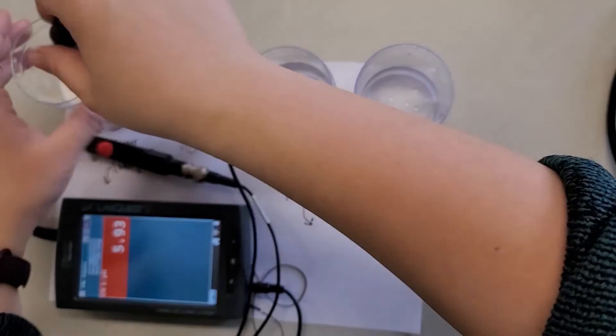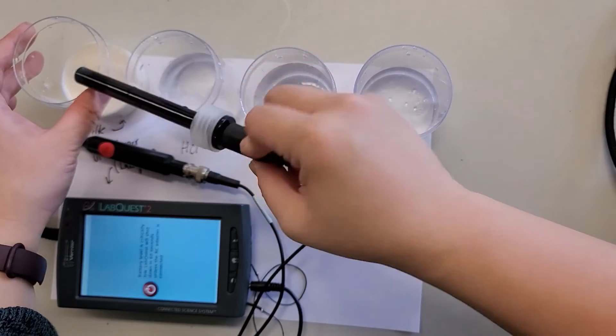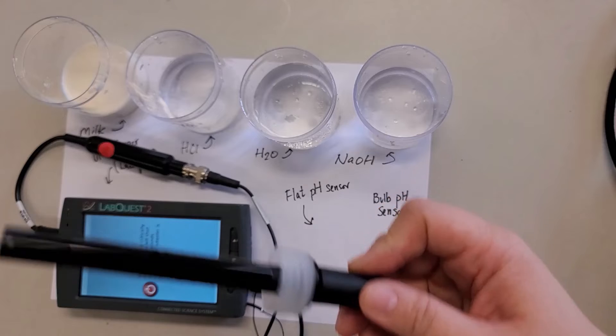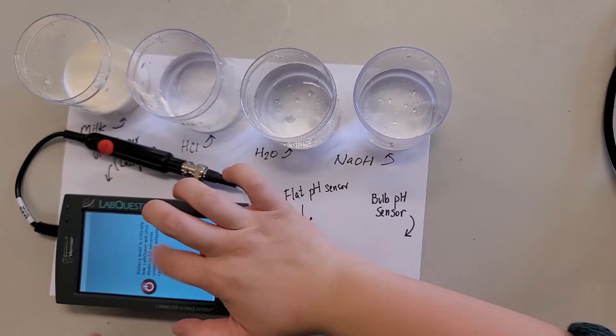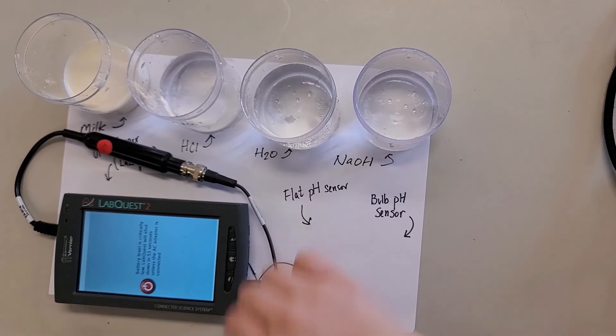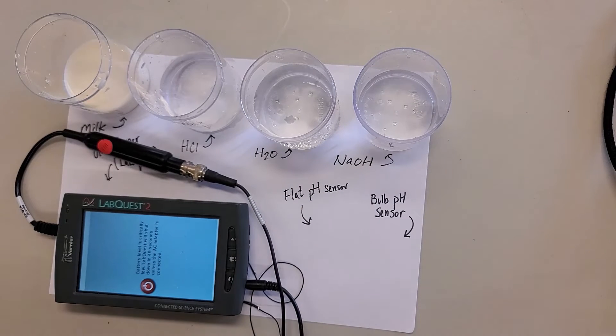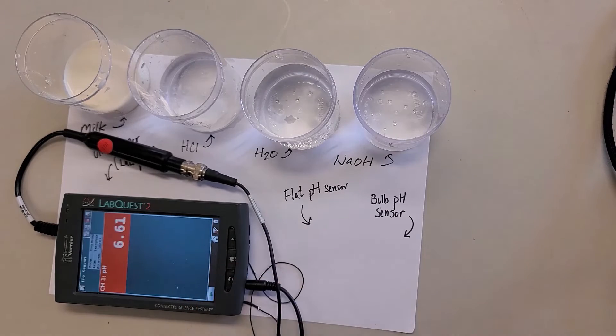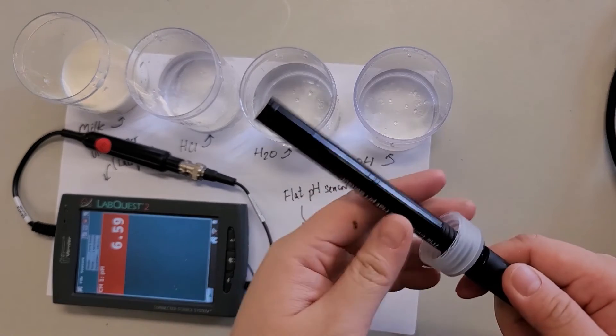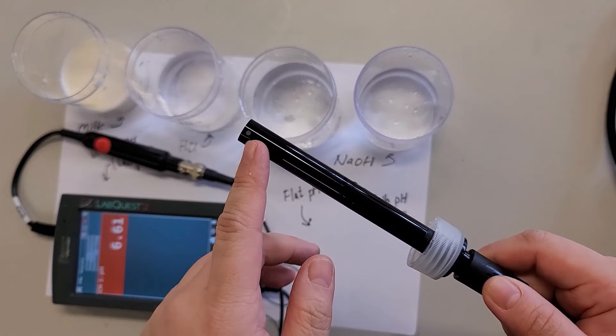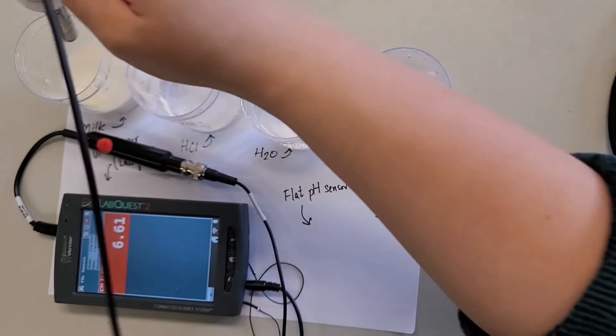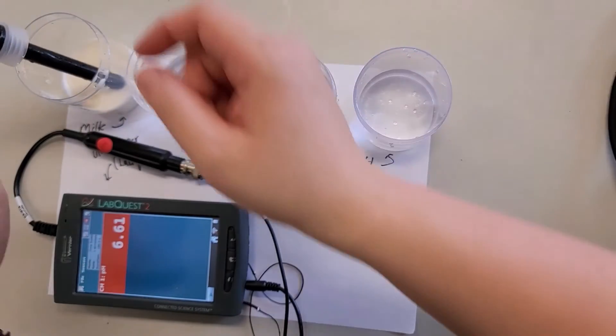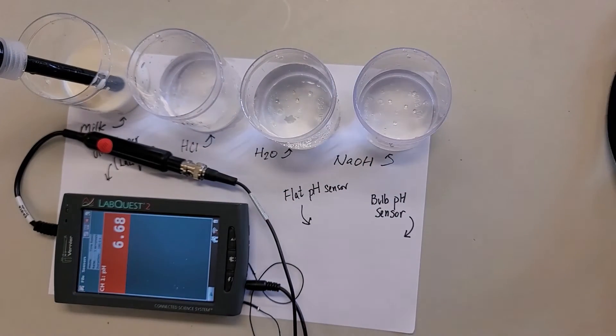Now when you put in the milk solution, you need to make sure, just one thing though - you need to make sure that this bulb here is submerged into the solution because that's how they detect it. So put it in and then wait for a while until it's stabilized.